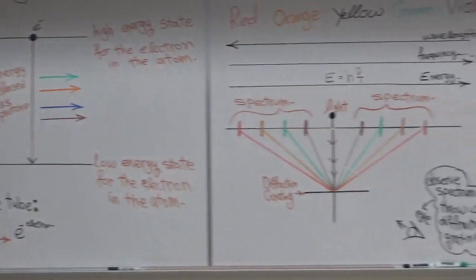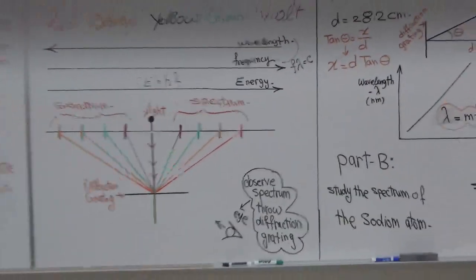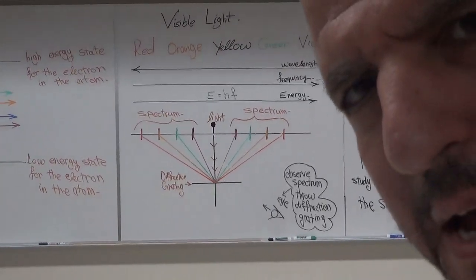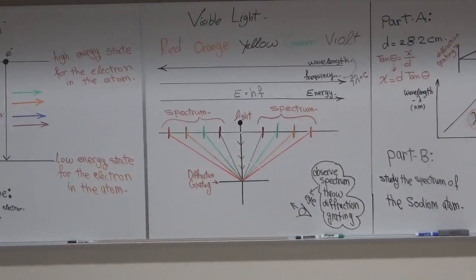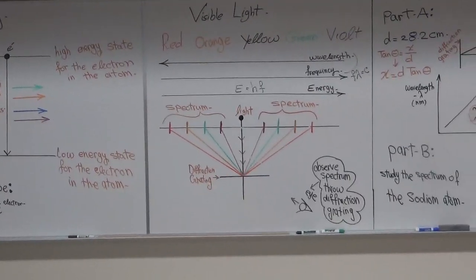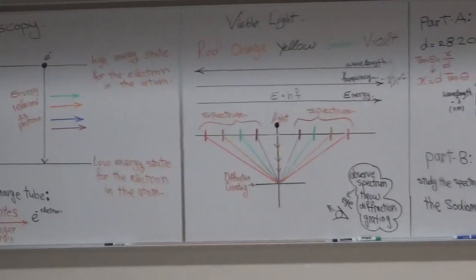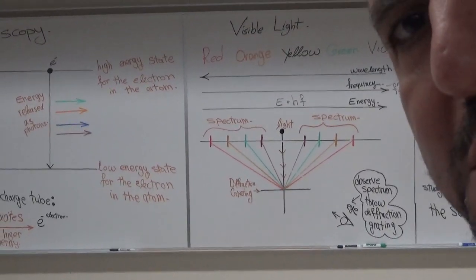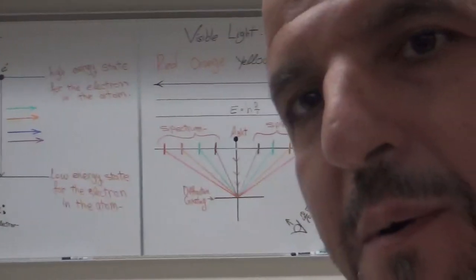Now if we come to the other side, right here, it will go back a little bit, guys, so you can see all of that. Maybe I need to move this a little bit up. So let's do that. Like this, just move it a little bit up.